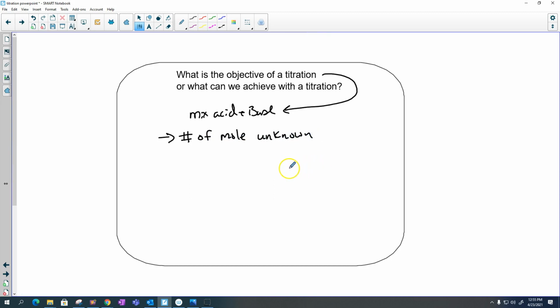Okay, well that's pretty nice, because essentially from this, there's a few things we can get. We can get a concentration of an unknown. And that is something we use a lot, as far as everything from, really everything, like lead in water, for example, or the concentration of anything that we deal with in the supermarket or anything else. You can test something to find unknown concentrations. We're always testing for concentrations.